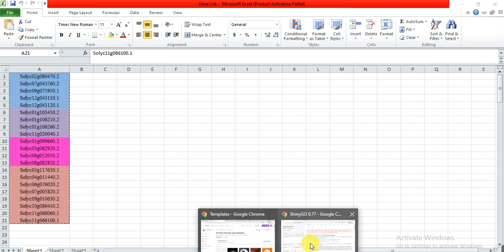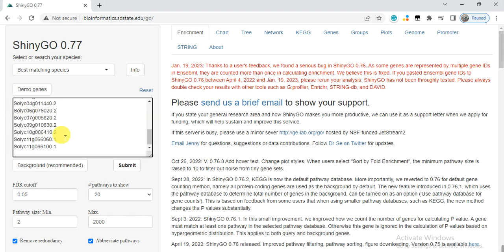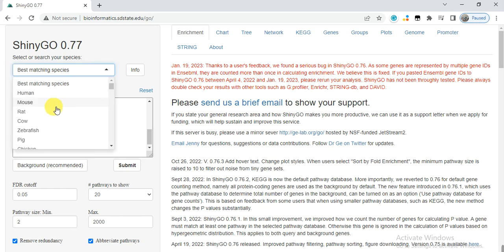I need to copy and then paste the gene list here. You can keep it at best matching species. I think you don't need to change it here. You have a lot of species, but you can keep it as it is.